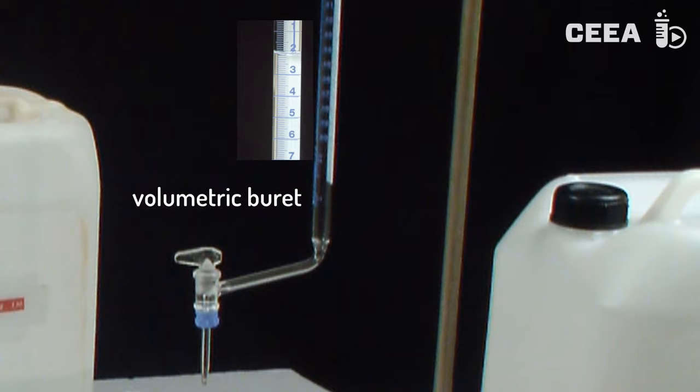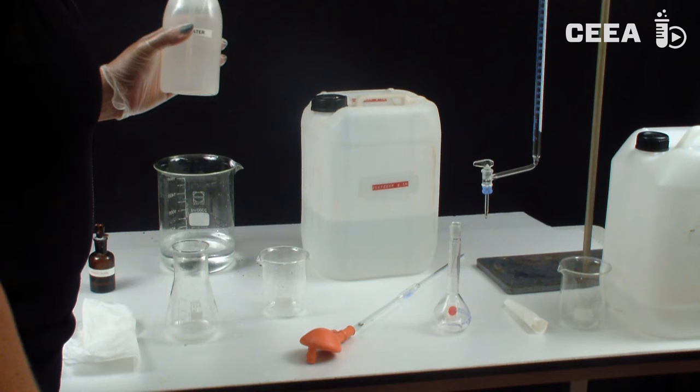The second decimal has to be estimated. As a rule, the raw sample cannot be analyzed directly but has to be diluted prior to titration.